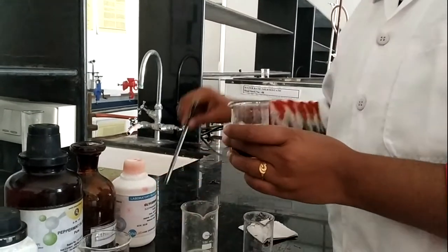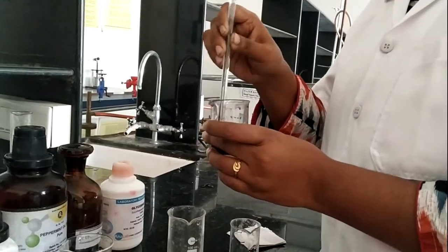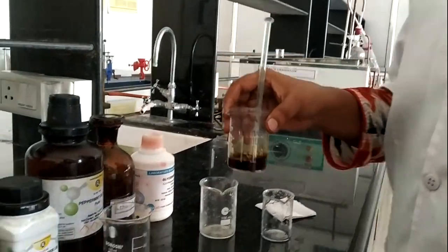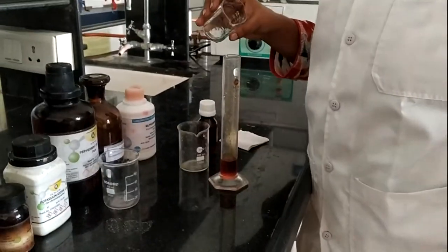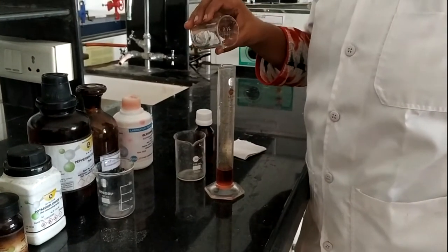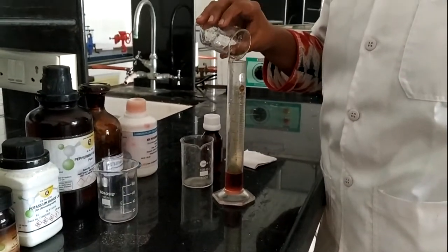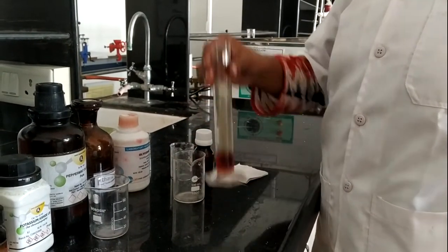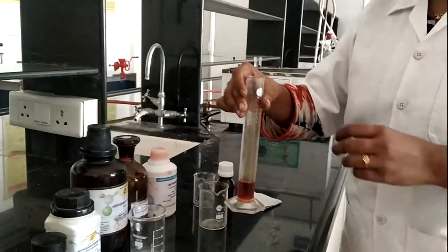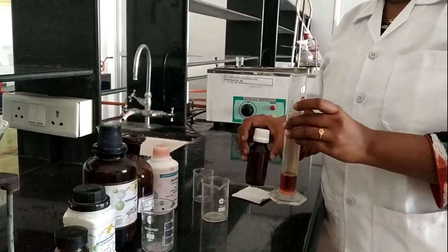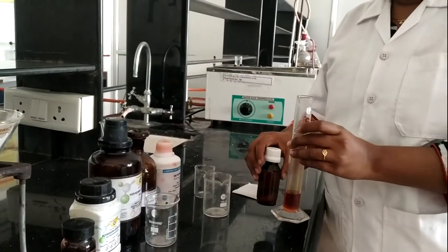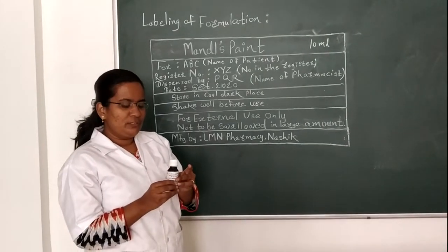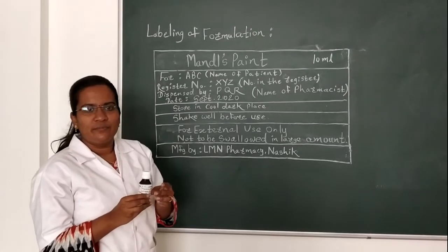Stir it properly and then proceed for volume makeup. Transfer the formulation into the measuring cylinder and make up the volume with glycerin up to 10 ml. Now pour it into the amber-colored bottle and proceed to the labeling part.